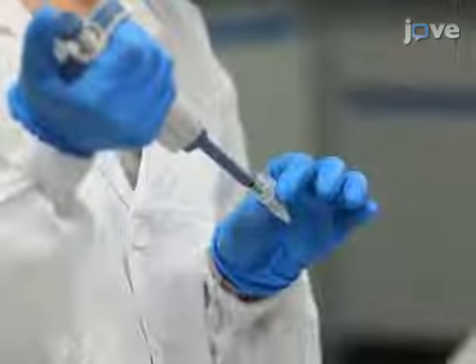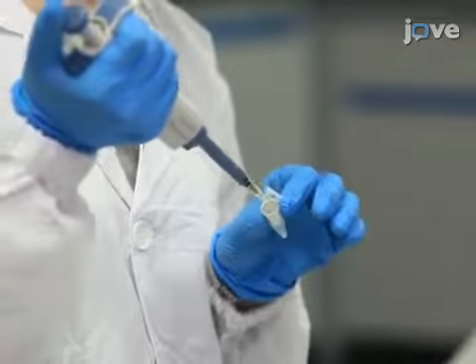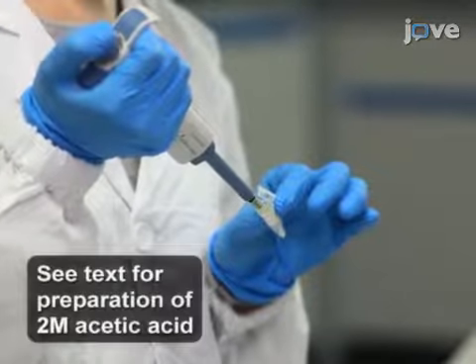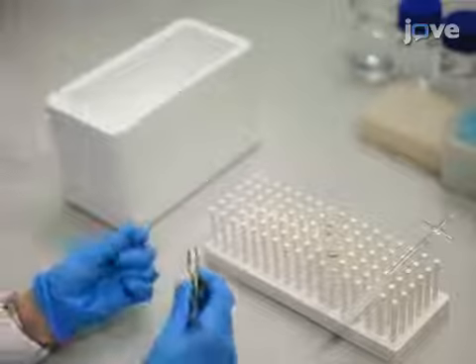To isolate sialic acids from milk, transfer 50 microliters of milk into a 1.5 milliliter centrifuge tube and add 1.2 milliliters of prepared aqueous acetic acid solution. To isolate sialic acids from liver tissue, gently thaw 20 to 50 milligrams of mouse liver and transfer it into a dounce tissue grinder.